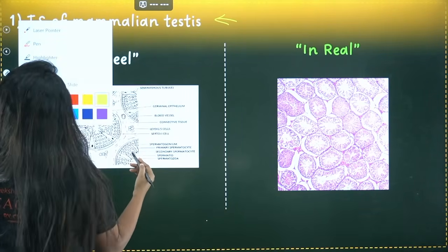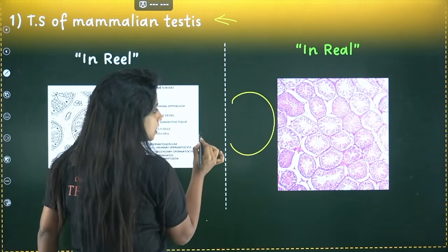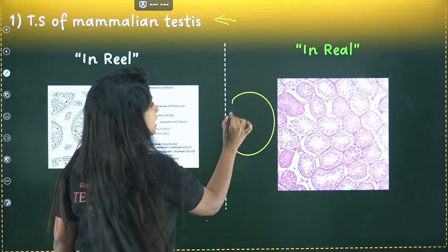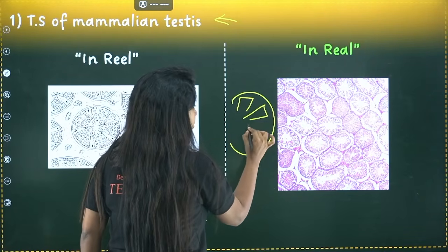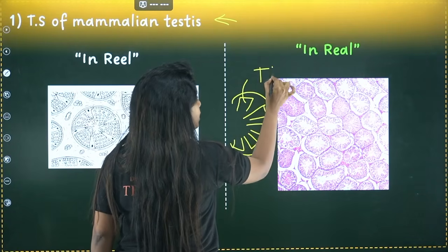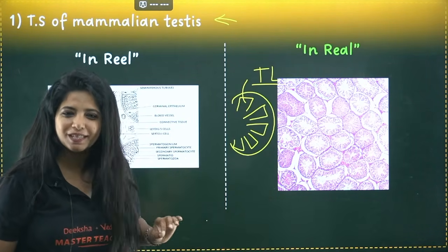If you have seen or studied the structure of testis, how does it go? So this is a testis. Testis has 250 testicular lobules. I usually used to forget testicular lobules, so I used to remember it like team leads. So 250 testicular lobules are there.